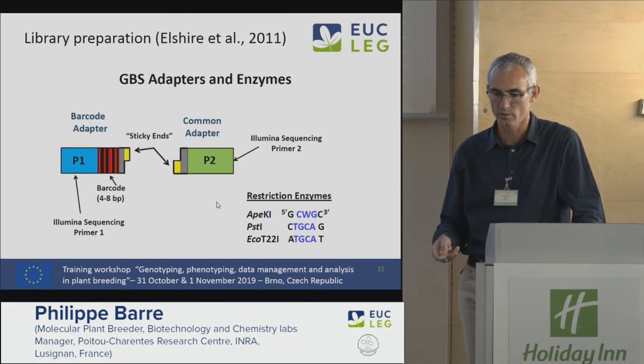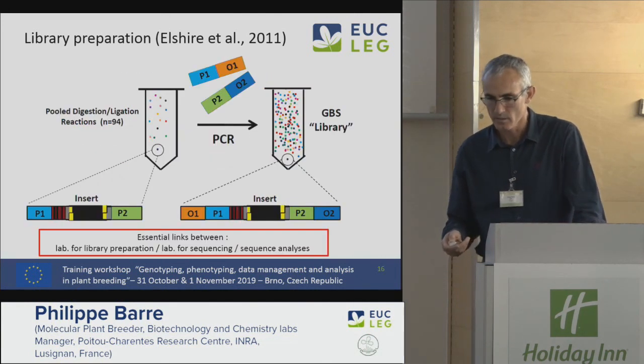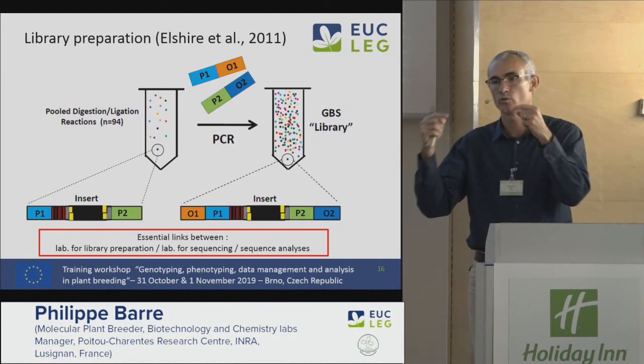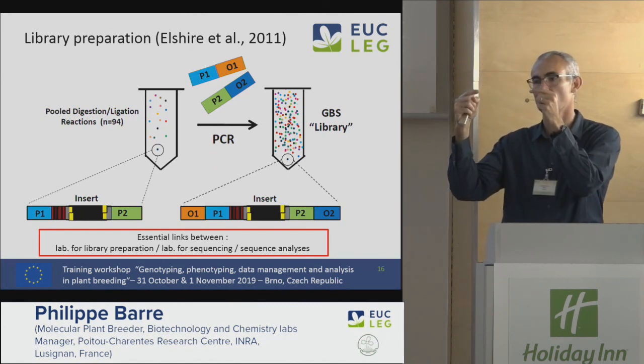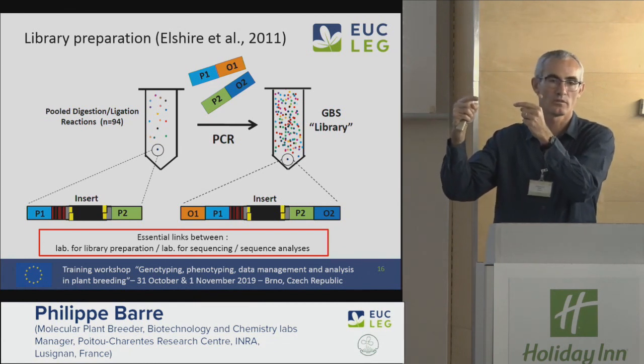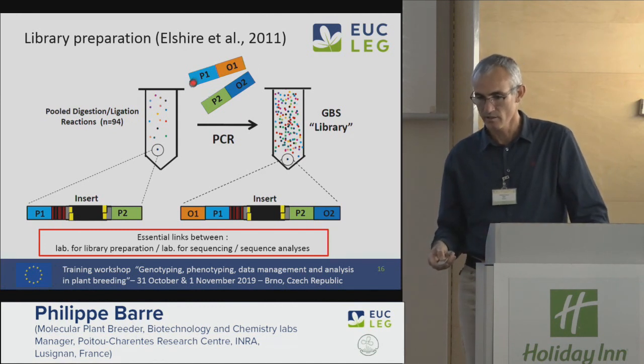And you can use different enzymes, like here you see ApeKI, PstI, etc. Then, when you do the PCR, you don't use just the adapter as the primers. What you use is this here.